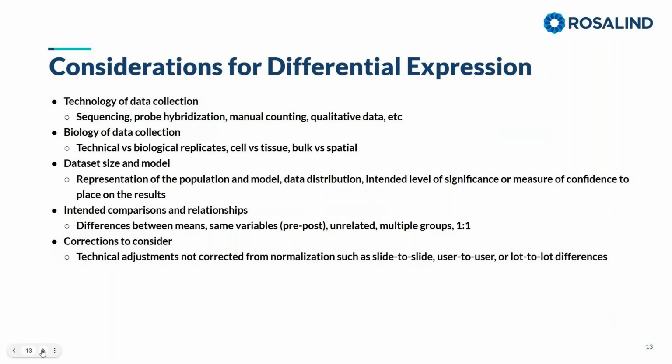So is this a pilot study? Do you not have a high level of measurement? Is this a phase 4 clinical study that is extremely large and at a specific level? So all of these things have a different intent and a measurement that you have, and you have designed it that way, and you need to be aware of how you designed it.